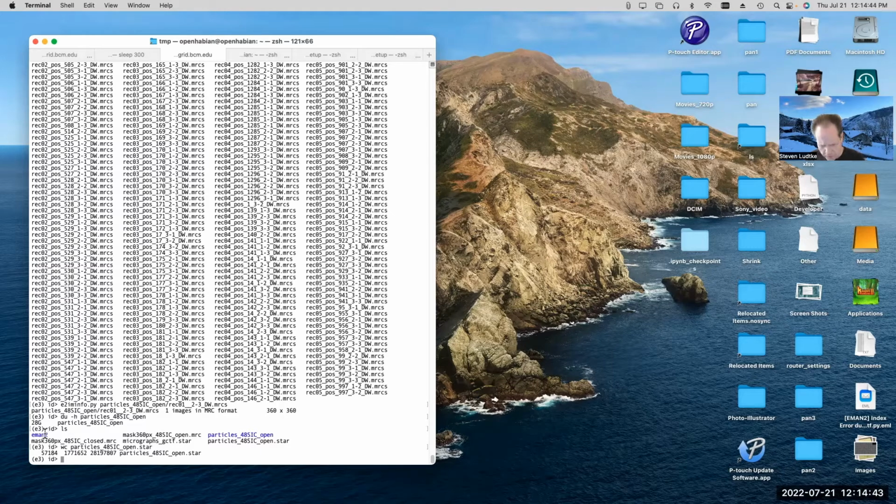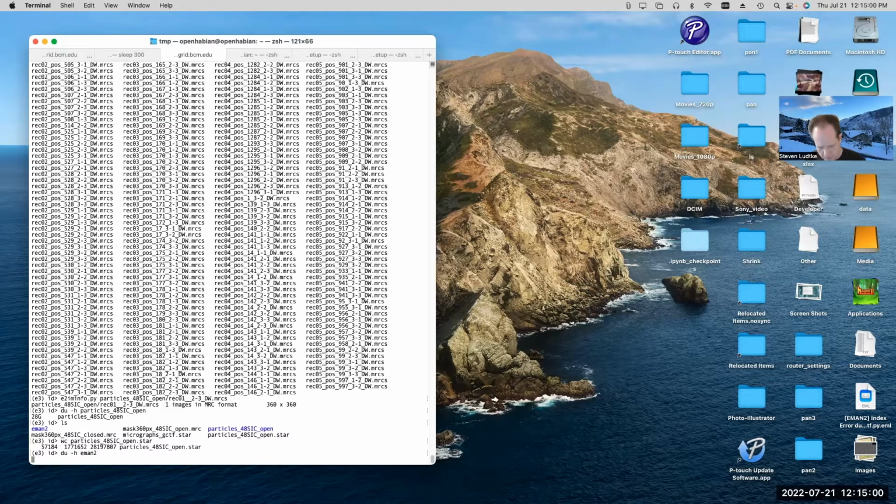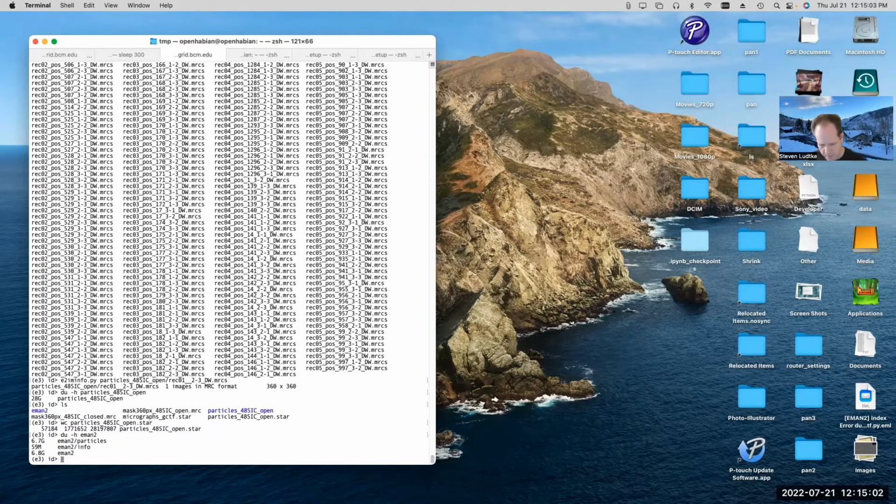The EMAN2 folder is a folder that I produced by importing the data into EMAN2, and we'll talk about that in a minute. But I will point out one useful thing, which is if we run that, the EMAN2 representation of exactly the same data is only 7 gigabytes, not 28 gigabytes. So it's reduced in size by about a factor of 4. And that relates to the data compression paper that I emailed out in the link this morning that people should look at.